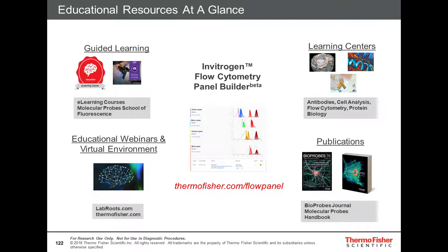Spreading is caused by photon counting error. That's just caused because of the nature of photons. If they have low energy, like teenagers, then they have a lot of spreading. It's just physics. And compensation helps us visualize that spreading, but it doesn't fix it. Until we get new PMTs that are better at detecting these photons, there's just no way around it other than good panel design.